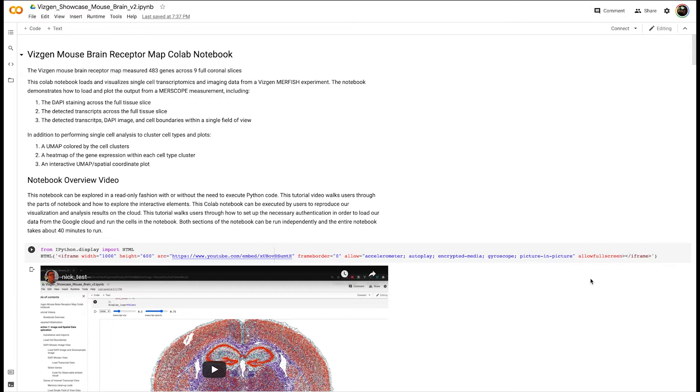This notebook demonstrates how we can explore and analyze a publicly available dataset for VisGen of the mouse brain receptor map.